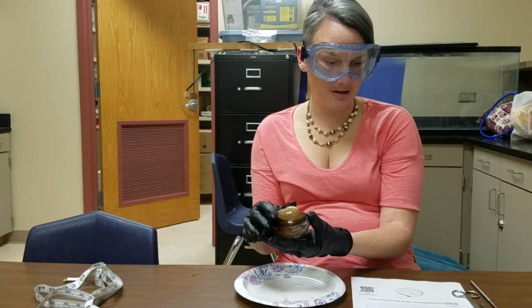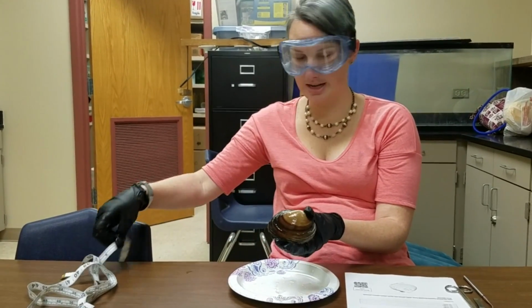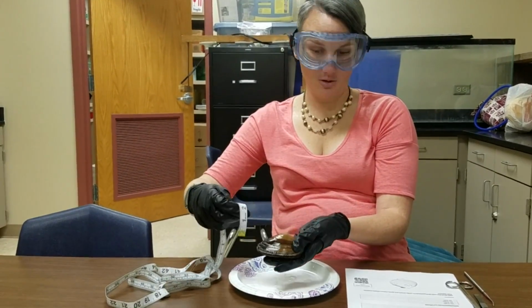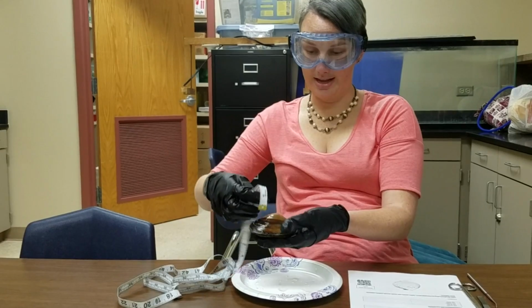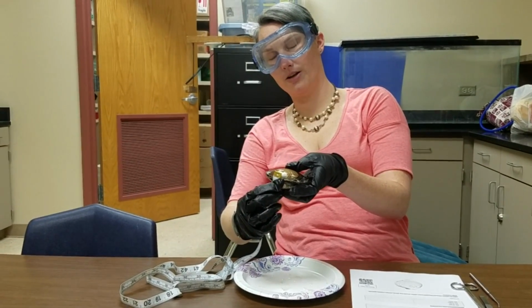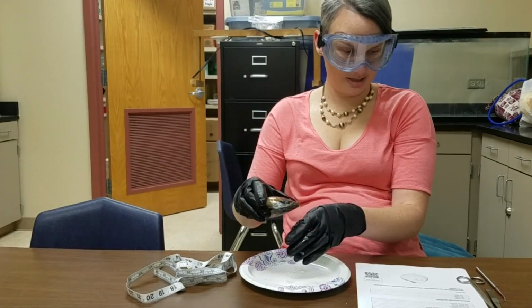And then 9 through 12, you're going to define anterior, posterior, dorsal, and ventral. Then you're going to measure your clam. When you're measuring it, you want to measure the length. So how long is it? The length is going to be this way. The width is going to be the opposite direction, so crossways. And then the height, you're going to see how tall your clam is, from where it sits on the ground to where the top of the shell is, as you look at it this way. And then you're going to get the mass. The mass probably won't be very much because they're kind of smallish.